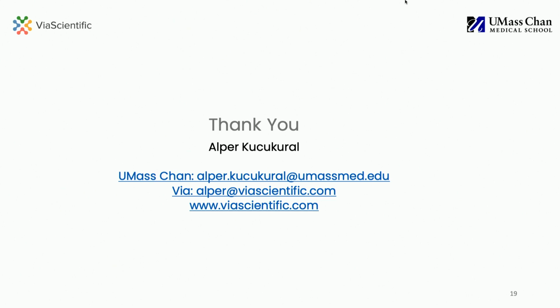The use case usually is startups. They don't want to hire a bioinformatician first, but they want to start doing these standard analysis pipelines, and they are asking, can you please create this pipeline for us? Some cores are using that in Germany.